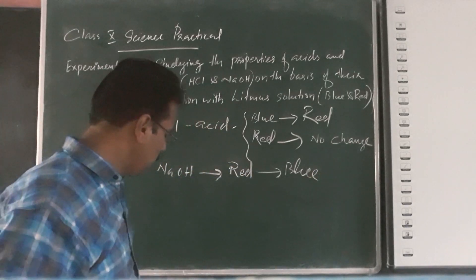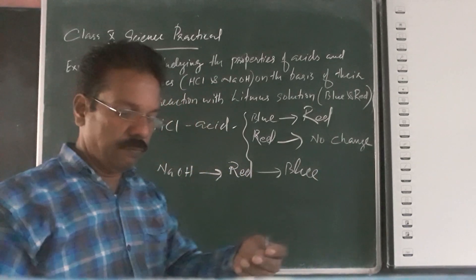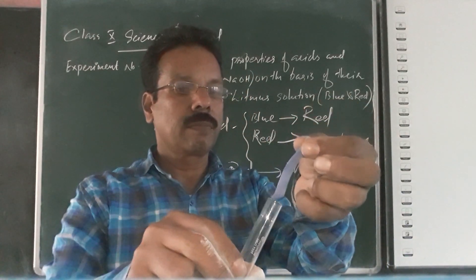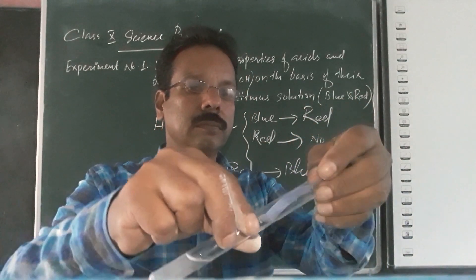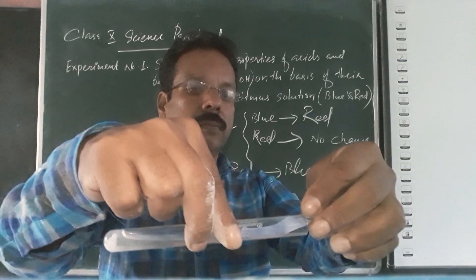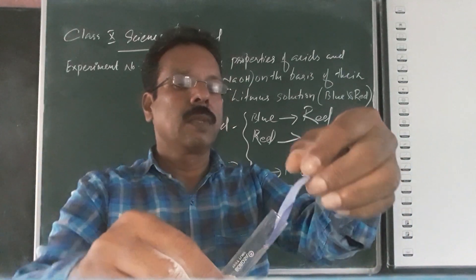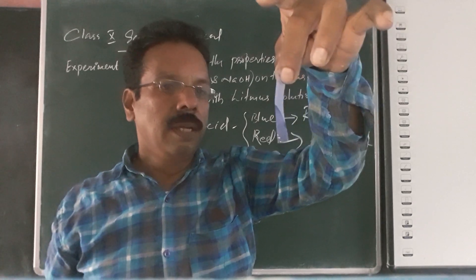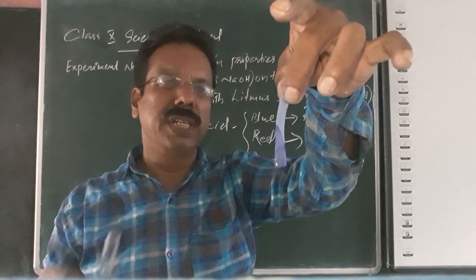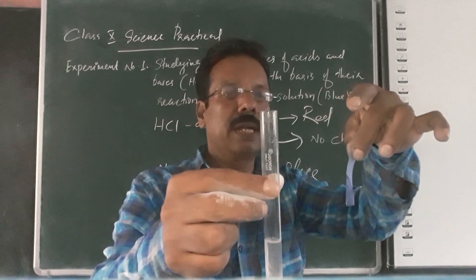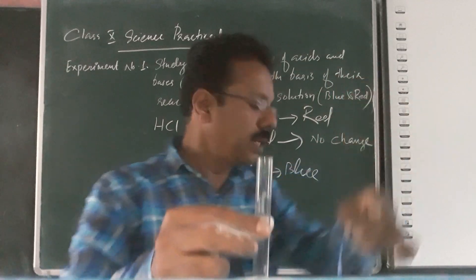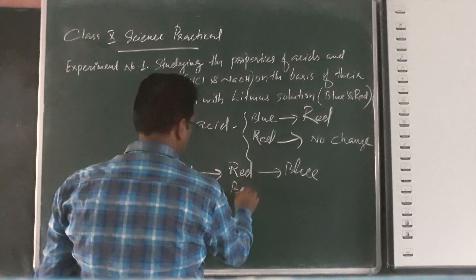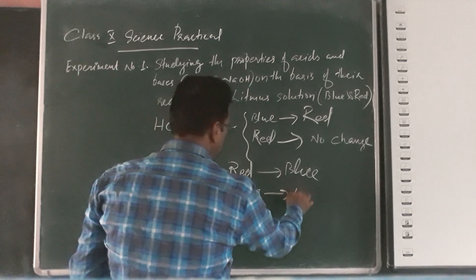And we can check with the blue litmus. Any color change? No change — only a wet appearance. There is no change for blue litmus in a base or sodium hydroxide solution. Therefore, blue litmus: no change.